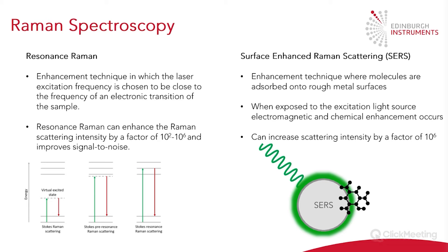One drawback of resonance Raman is the increased fluorescence that can swamp a Raman signal. When you match the laser to an absorption band, absorption will occur, meaning there is a high chance of fluorescence completely obscuring the Raman peaks. This interference is one of the biggest limits for the use of resonance Raman in the field today. However, we can get around this by using pre-resonance Raman, where we use an excitation about 100 wavenumbers below the electronic transition. Here we'll still get some enhancement, but fortunately we will also see less risk of fluorescence swamping the sample.